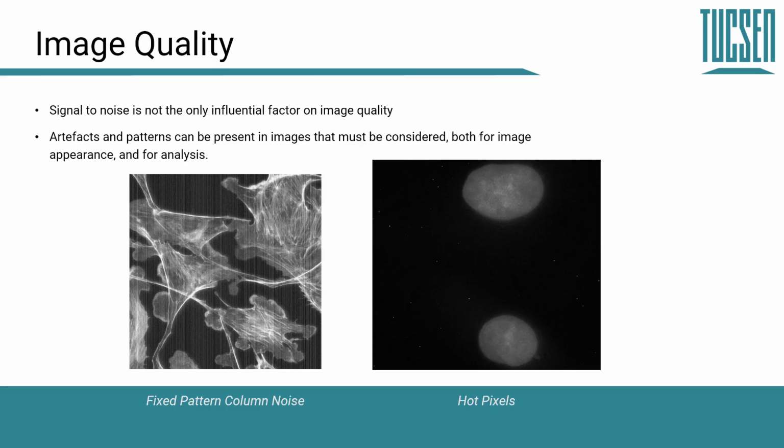These analog to digital converters can sometimes, if they're not adequately calibrated, which is quite an intensive process, if they're not adequately calibrated by the camera manufacturer, they can have slight offset variations, this value that the camera exhibits at no signal. And these slight differences in offset can transmit in the form of a pattern on which low light signals will be overlaid. And this can sometimes be problematic and at the very least be unsightly and not nice to look at.